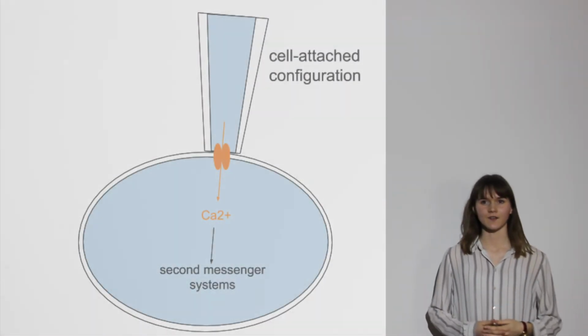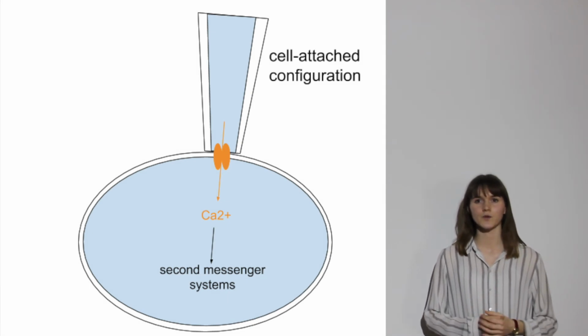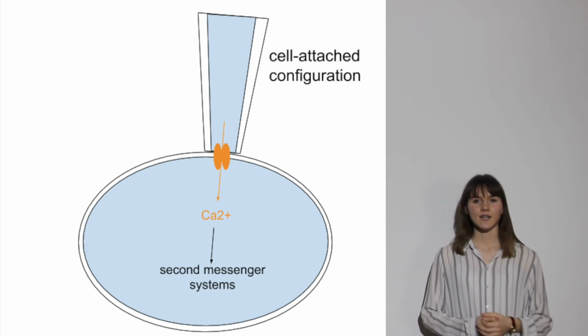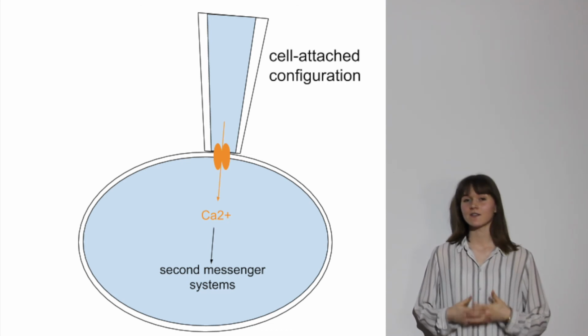To study calcium channels, the cell-attached configuration is an important asset, as calcium channels are known to be regulated by intracellular second messenger systems, and this mechanism is not disruptive. What's more, calcium channels' activity can be studied.